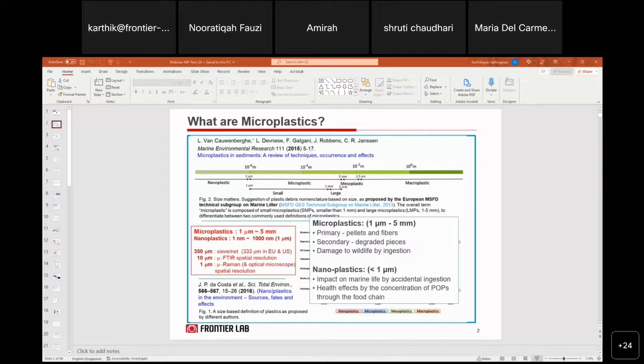As I said, people are interested in small microplastics, which are 1 millimeter and below. Similarly, there is considerable interest in nanoplastic as well. Today we will be talking more about microplastics, but in terms of mass-based analysis, where we will talk about microgram and nanogram. That is what you will learn from today's webinar.